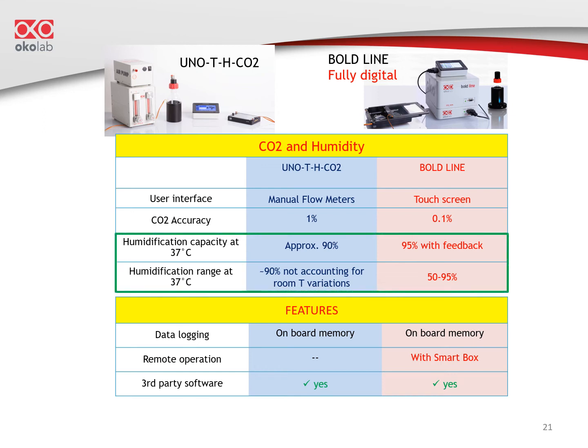Humidity on UNO doesn't have a sensor and is not automatically adjusting if the room temperature fluctuates. HM Active uses feedback to ensure the desired relative humidity. Both use a bottle where you can see the water level and can add to it without perturbing the sample.